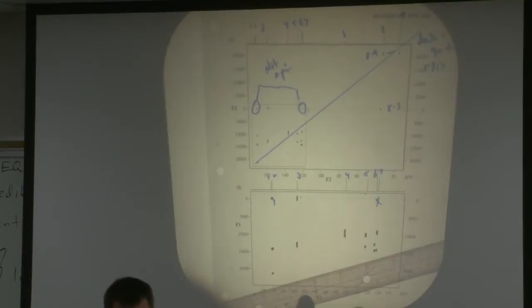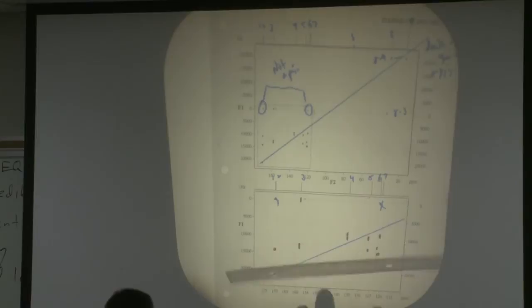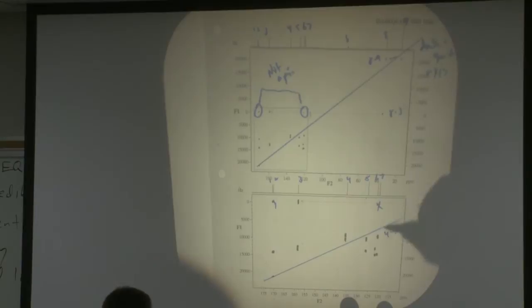And so then, as we continue along our double quantum axis here, you'll see that you can just pick up your pairs. You're going to get your 4-7 pair. You'll get your 4-5 pair here. You've got a 3-6 pair here. You have a 3-5 pair below that, a 2-7 and a 1-6 pair here.